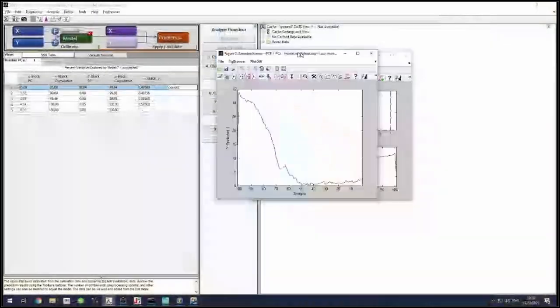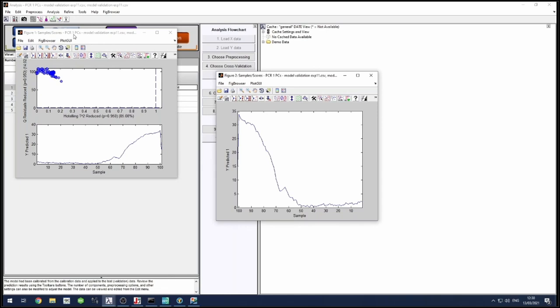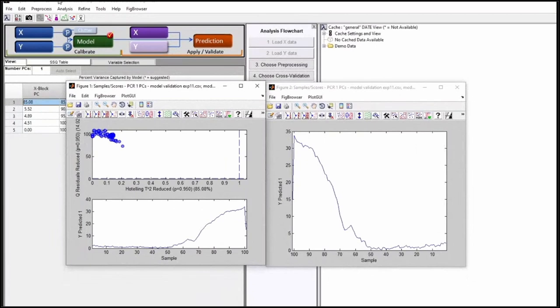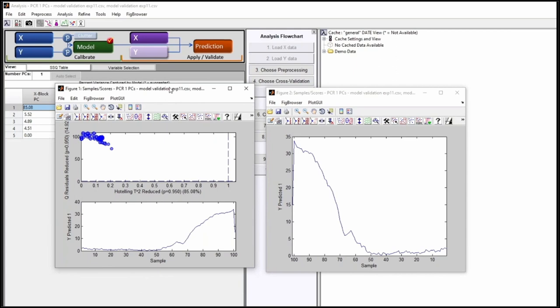What we're looking at here, if you can see my screen, I have two windows open on top of the others. This is a piece of chemometrics software. This is Solo. There are many others available on the market. One that's very commonly used in industry is Camo Unscrambler, which might be familiar to some of you. We have developed our own in-house chemometrics software specifically for near-infrared spectroscopy. But these tools are more general statistical analysis packages that can be used to interpret any two data sets, in fact far more than just two. You can build a model from any two data sets by comparing one to the other.